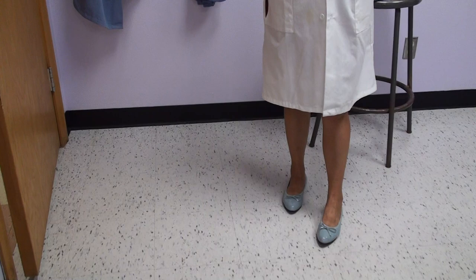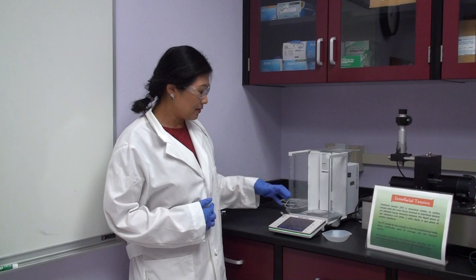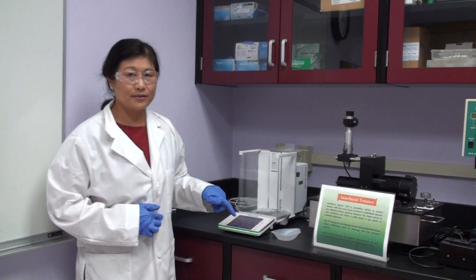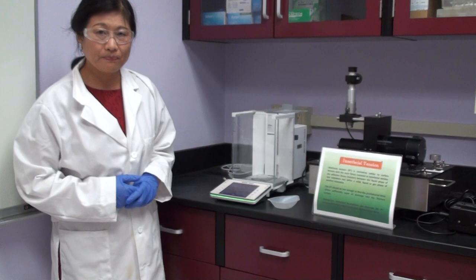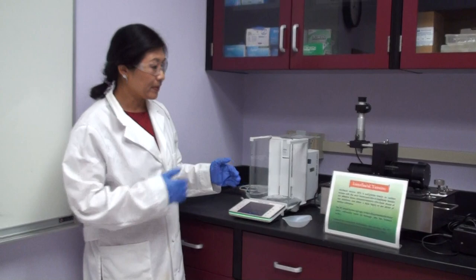Okay, so the first equipment here, we have a very high resolution scale. We can measure very light amount of particles with this container, with the digital precision about 0.0001 gram. We can also measure at least 100 gram using this scale, and we do have another scale with two digits inside of another room.